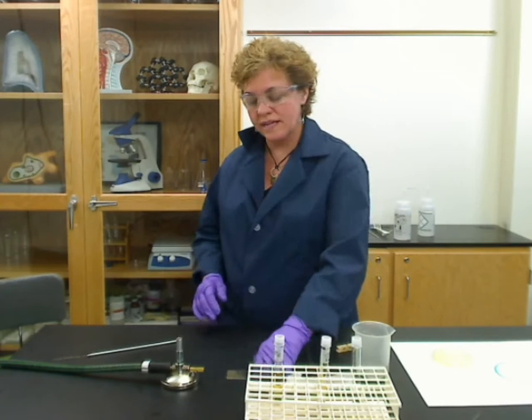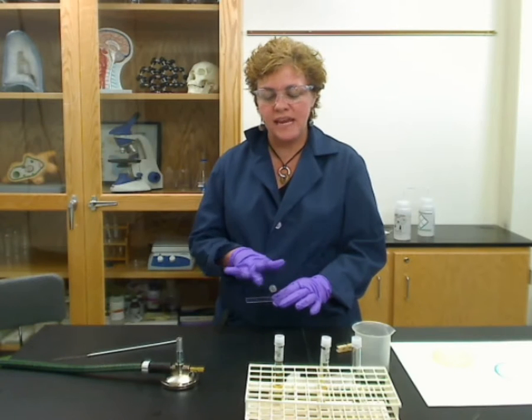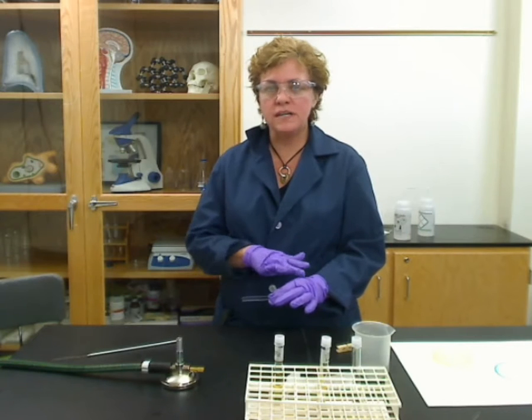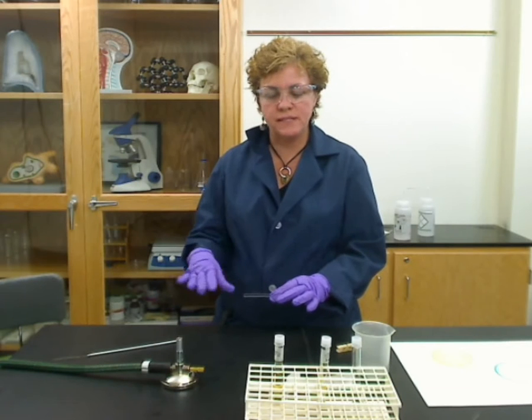Once it dries, it should have a very thin haze to it — it shouldn't be milky. If it's milky, there may be too many bacteria. You want a very thin layer of bacteria on the slide.